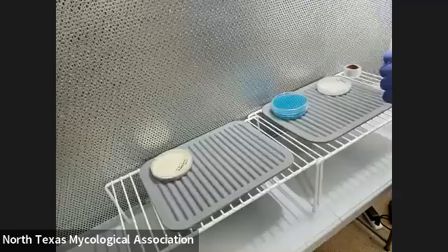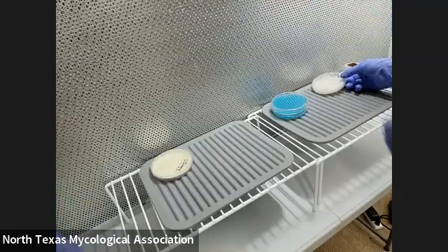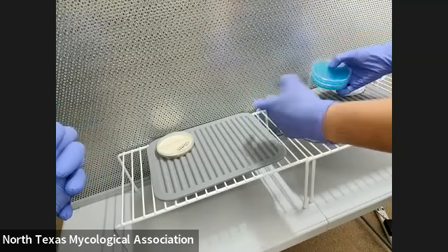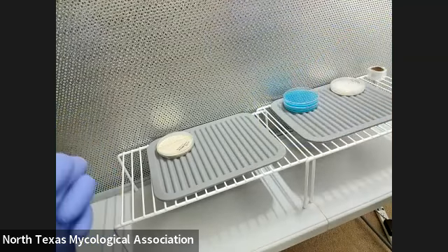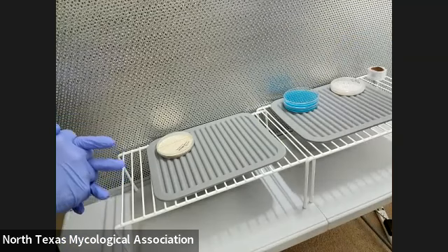All right, I'm going to show you how I do this. Can you see, Eva? Yeah, I can see. So now when it's set up, everything has to be still — that's why it's in front of the hood. But under the still air box, it's going to be fine.